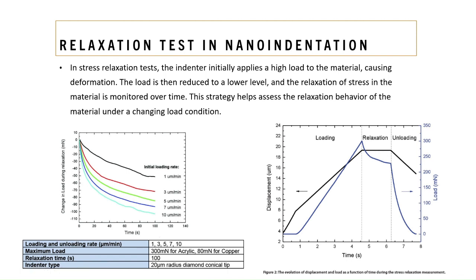As a result, when the indentations are made at lower loading rates, due to the creep effect of the material, a larger maximum depth is reached during the loading phase. Both the acrylic and copper samples exhibit a stress relaxation behavior when the position of the indentation at the targeted maximum load is held constant. And for tests with higher indentation loading rates, larger load loss was observed during the relaxation stage.